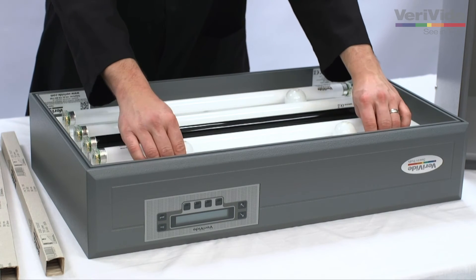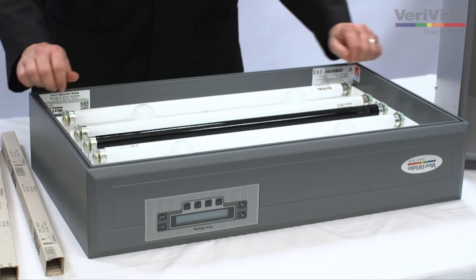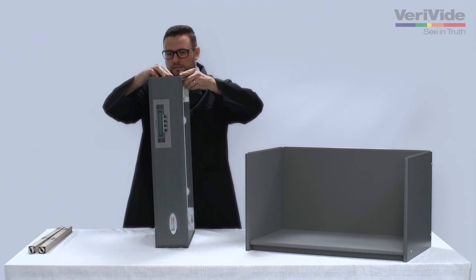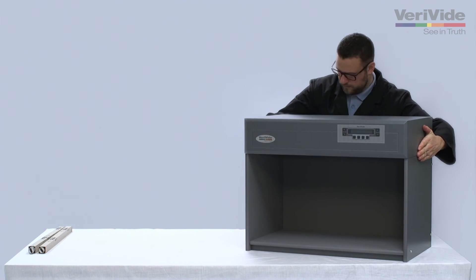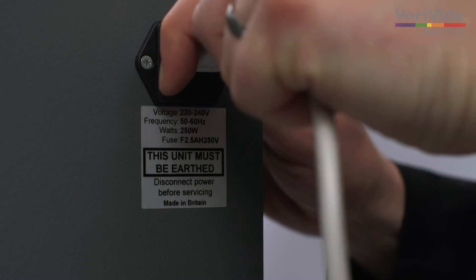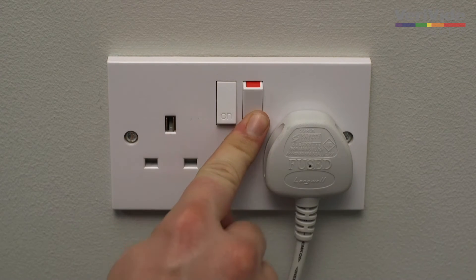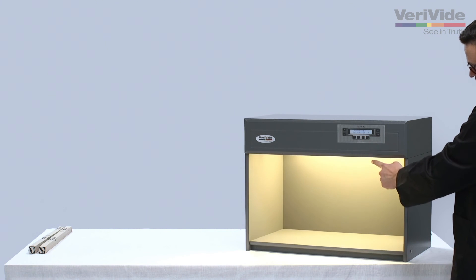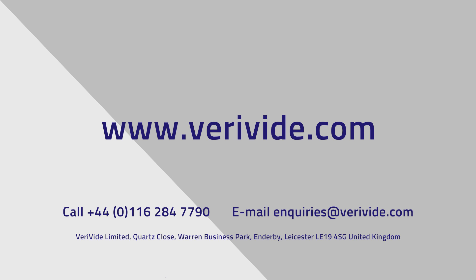Ensure that both lamps are secure before replacing the canopy. To replace the canopy, lift it from the surface and place onto the base unit, ensuring it is securely in place. Replace the power cable. Switch the mains power back on. Check lamp functionality by switching through all light sources. If you encounter any problems at this stage, please contact Verivide.